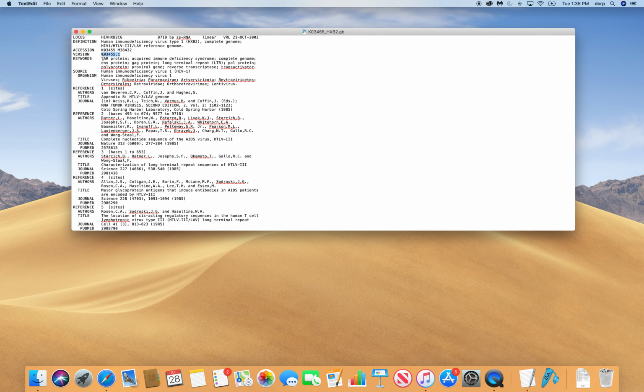And then we have some keywords of things that are in this record. So we have tar, tar protein. That's actually not a protein. Well, that would be TAT, I think. What else? GAG protein. We don't really have GAG protein.